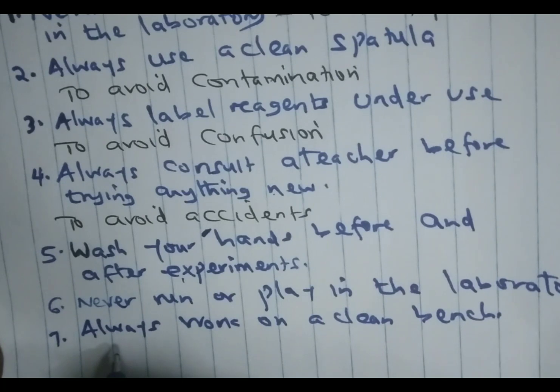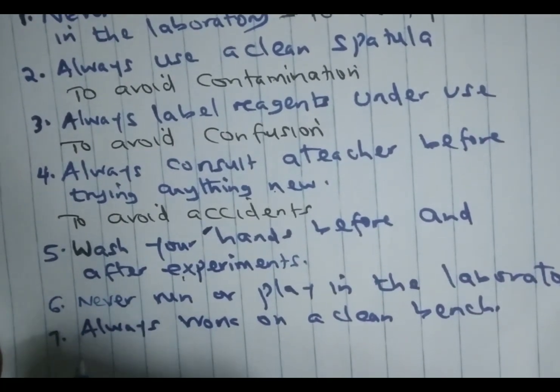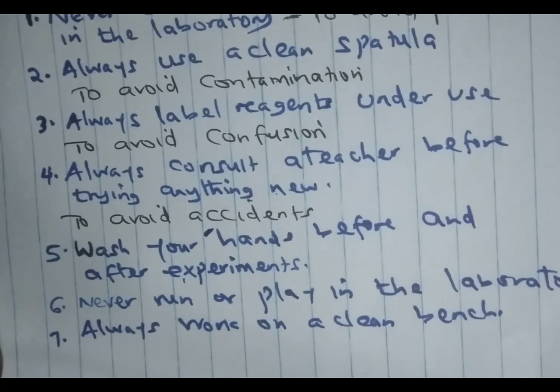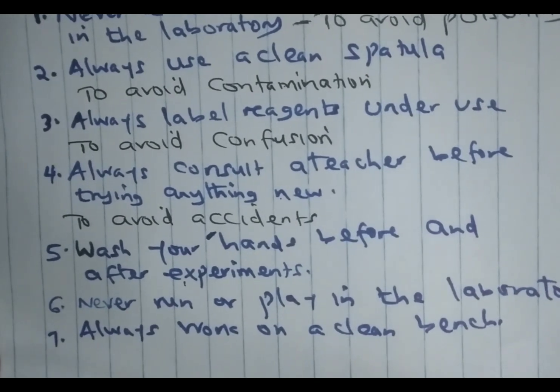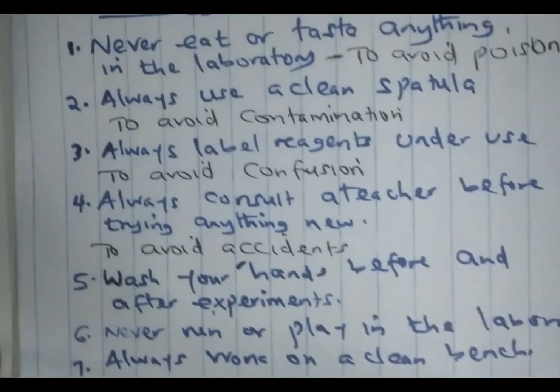Number seven, you work always from a clean bench and you will be very safe during your stay in the laboratory. We have many other rules that we are going to discuss later in our subsequent lessons.